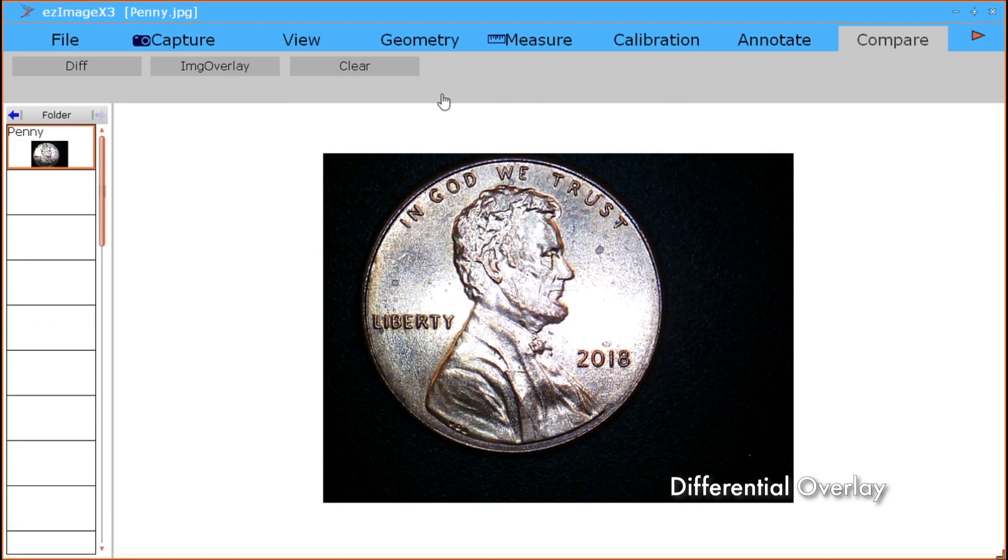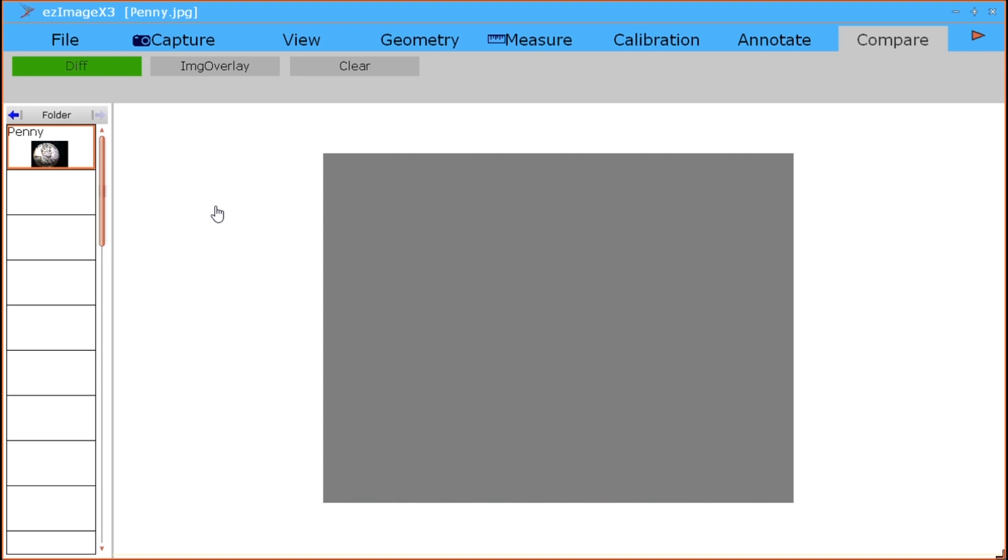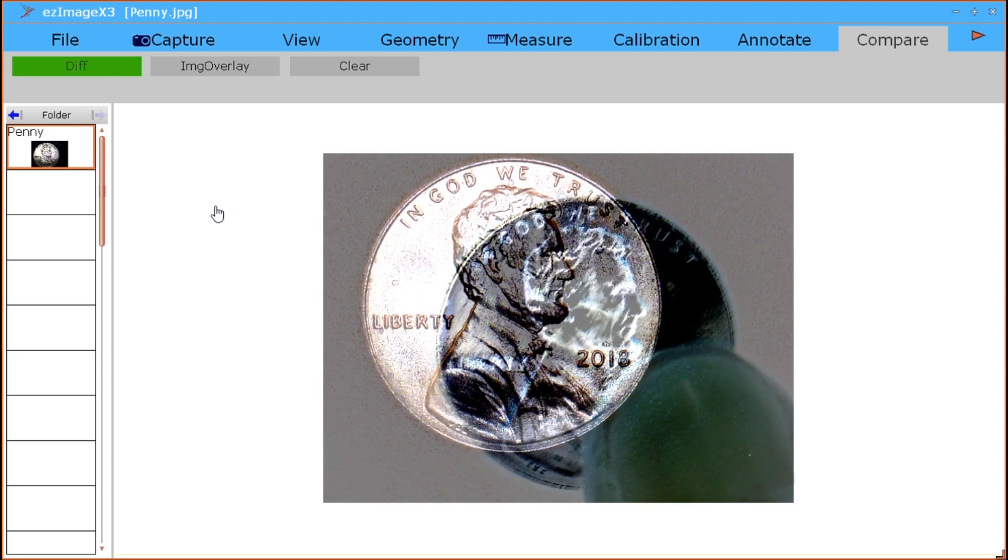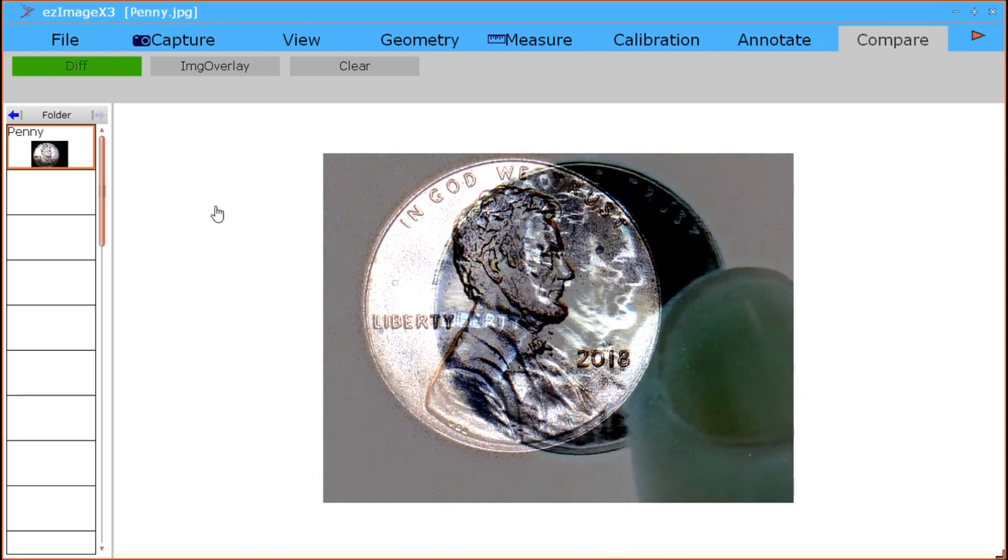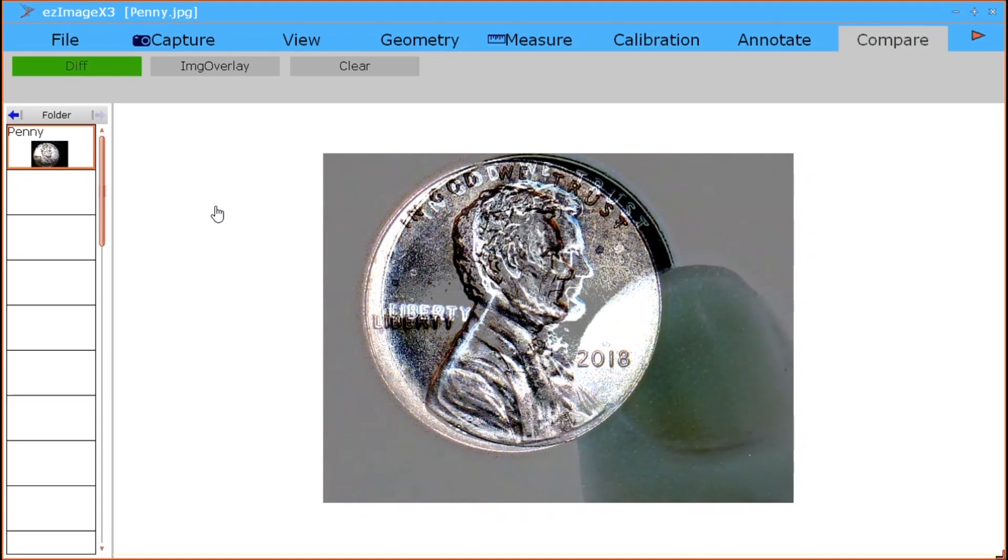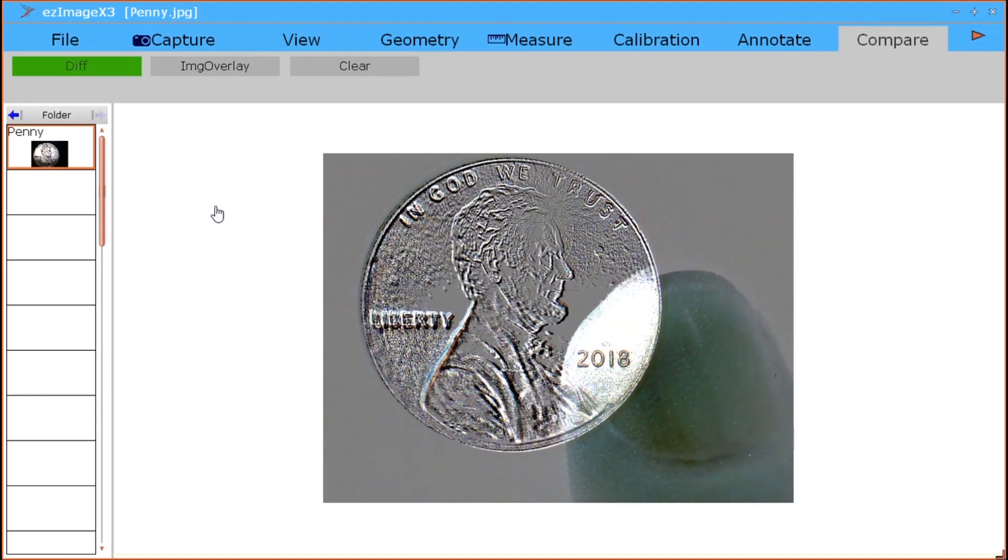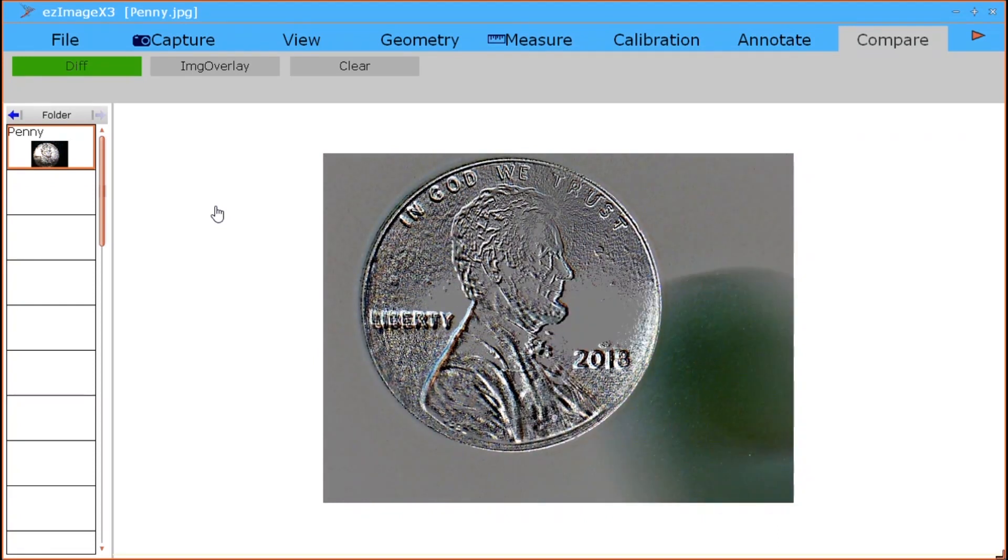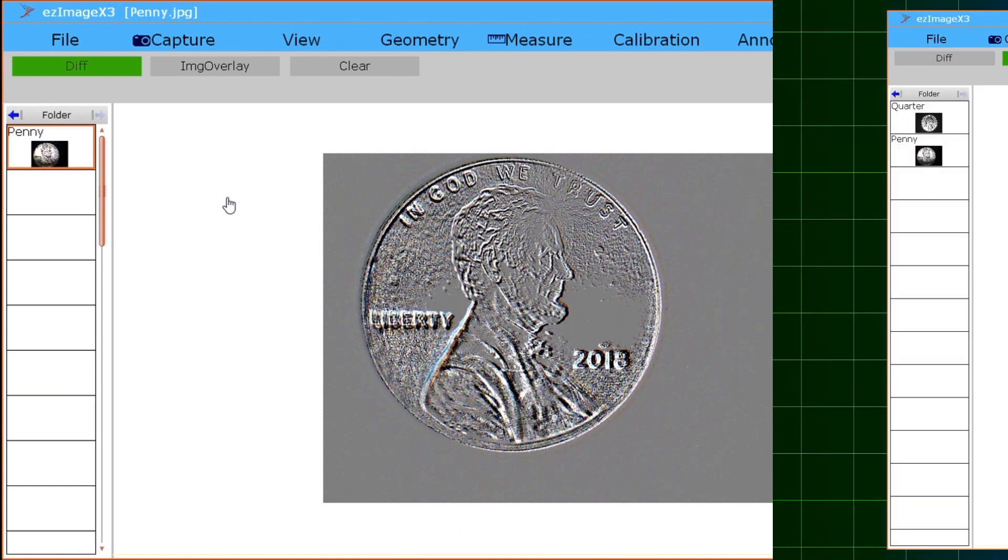Differential overlay. When the differential overlay mode is selected, Easy Image X3 captures a freeze frame of the object beneath the camera, then generates a negative live video signal above the freeze frame. When the live video and the freeze frame image are lined up, similarities will appear flat and gray, while differences will stand out.